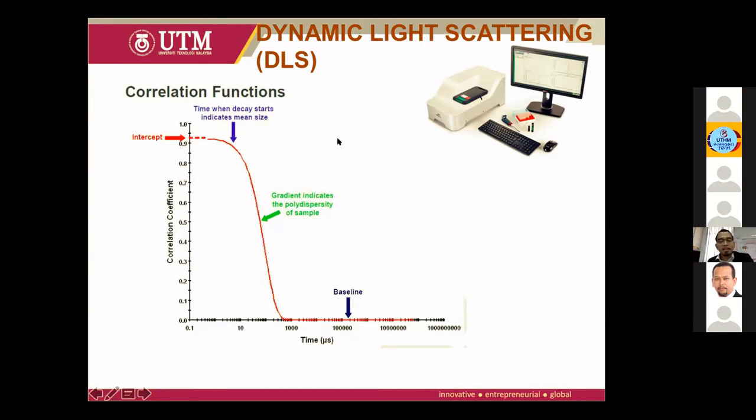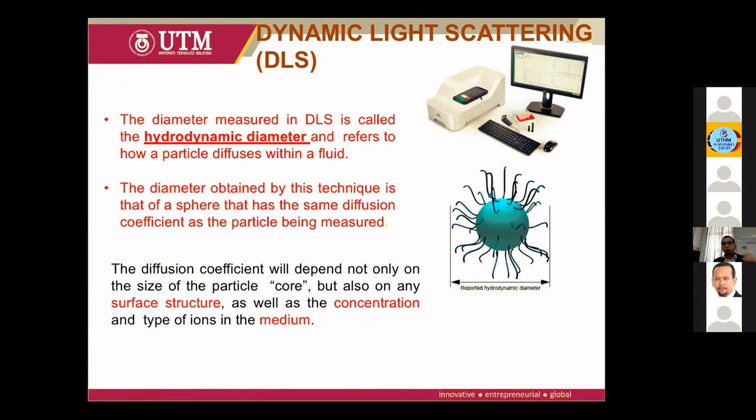Okay, so not only can we know the mean of the size, but also how well dispersed your particles are in the solution. That can also be retrieved by the use of DLS. But when we talk about the size, take note that the size using DLS here is the hydrodynamic diameter. We are going to discuss further on the hydrodynamic diameter.